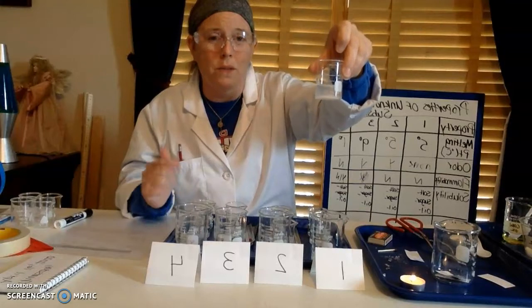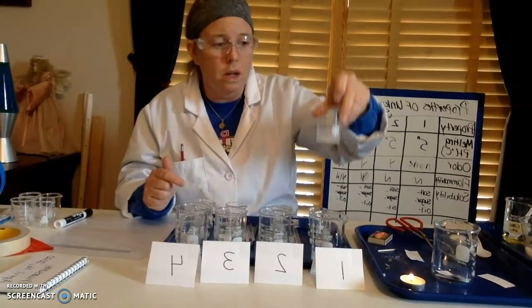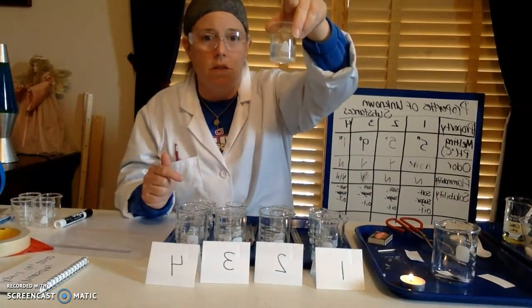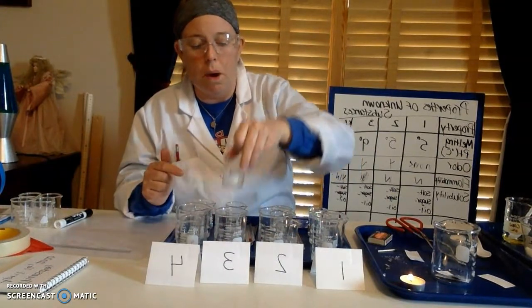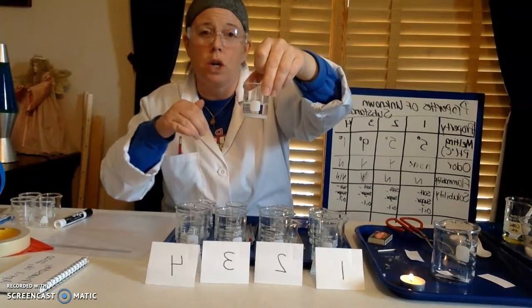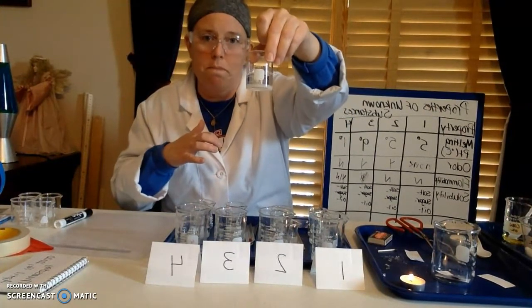So that's quite a bit of salt. This is salt in substance 1. Quite a bit of salt in the substance, so this is definitely dissolving. Again, if it has time, this is dissolving. Probably more than likely what's happened is I've supersaturated it, meaning I've put so much salt or sugar or oil in these substances that it has done its job.